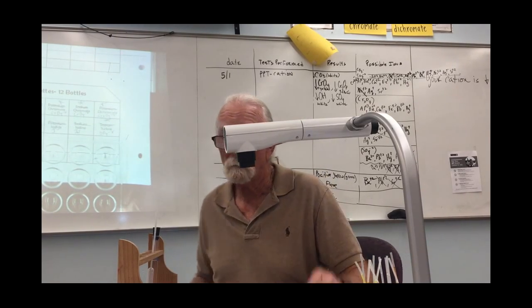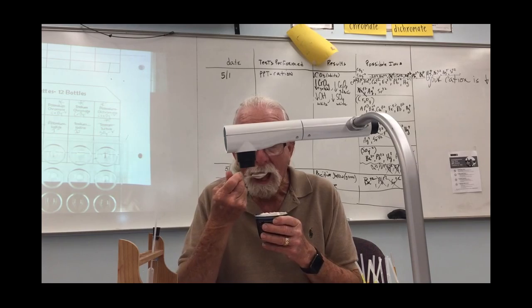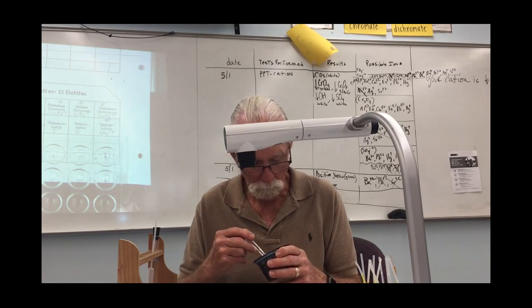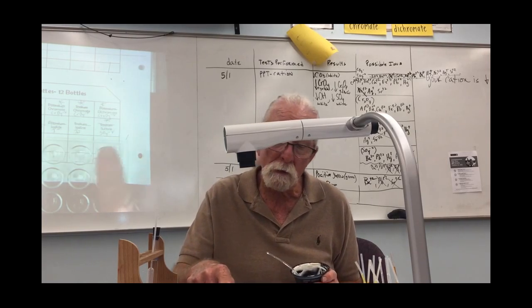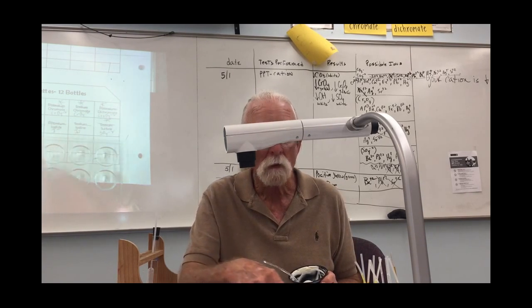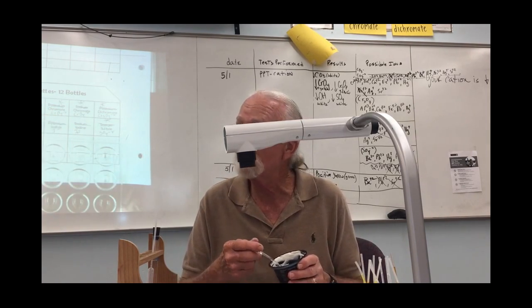Now, which 3 reagents did we say do not precipitate with anything? Anybody tell me that? Yes, ma'am. Potassium, sodium, and ammonium. Right. Ammonium, potassium, and sodium. Now you'll notice all the cation bottles have them in them. Sodium, potassium, or ammonium. Cross them out and put in just the anion. Br minus, CO3 minus 2, Cl minus.